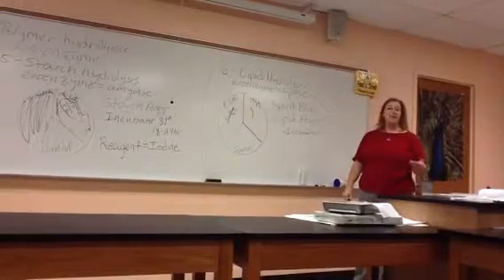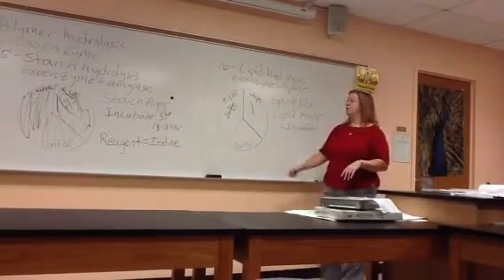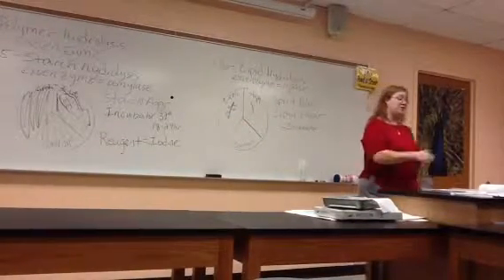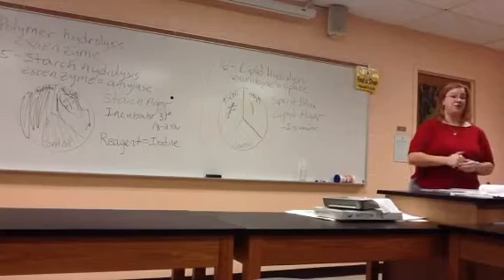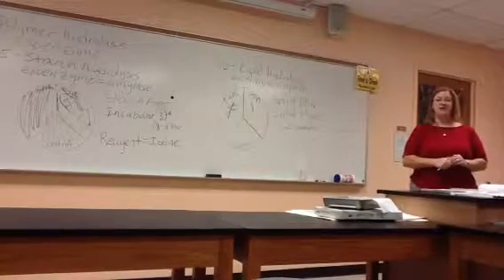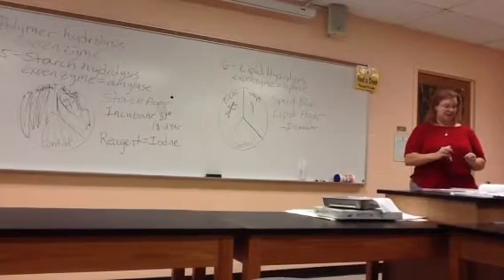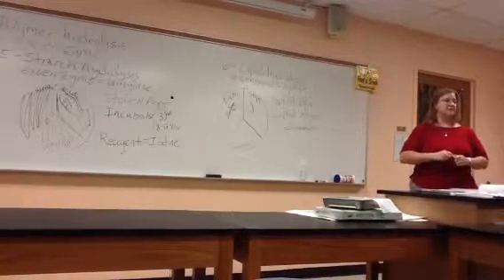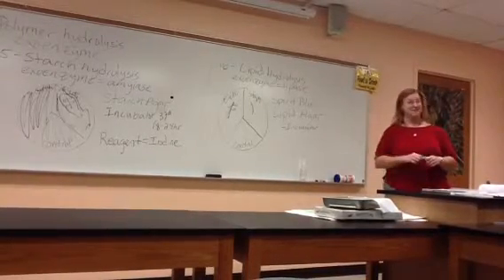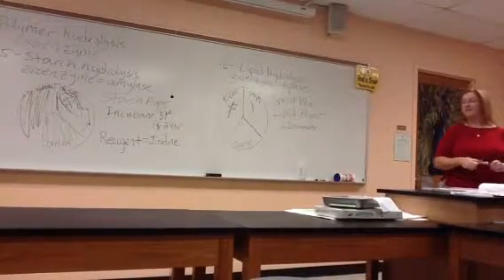So that's why we don't have to have any reagent for this. We're going to be able to see it on Monday. Positive result, the bacteria themselves are an intense blue color, even more blue than that plate is right now. So positive result looks like bacteria are an intense blue color. And what does that tell us about them? They're positive. They're positive for what? They produce lipase. Good. They produce lipase. Intense blue color.